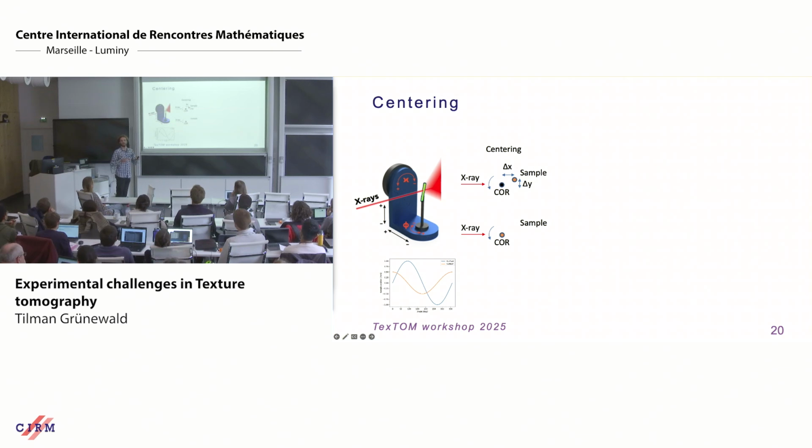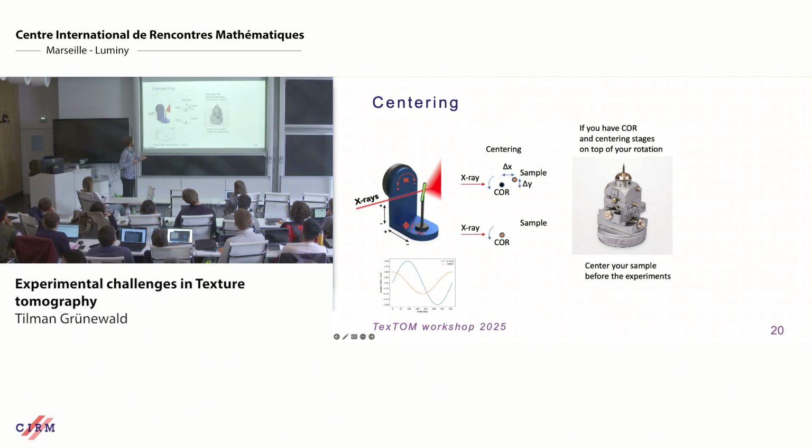If you have a big diffractometer, this is no problem. But if you turn to the nanobeam side of life, having centering stages on top of these two rotational tilt stages starts to become tricky. So you're lucky if you have this. That's great, that's good for micron-sized resolution or stepping.